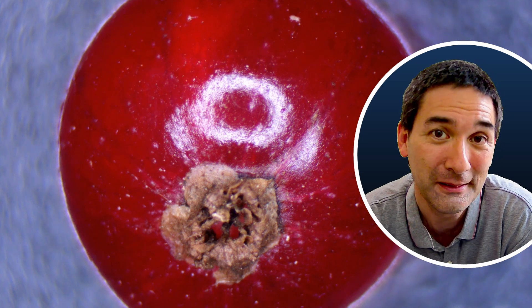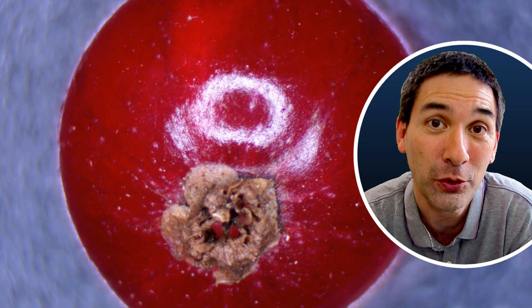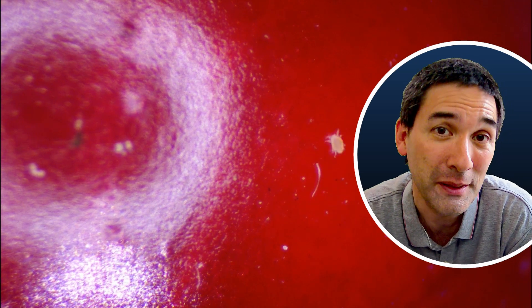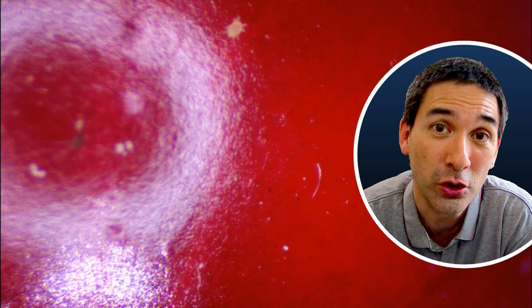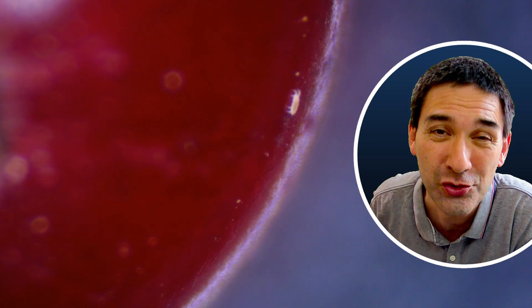I didn't know that they were living on them, and I just ate the berries without actually washing them — and here they are. Under my stereo microscope I could observe them running around in a circle on the berry, and then I tried to catch them and put them under my compound microscope.